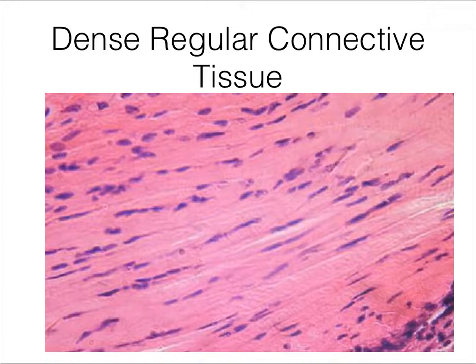Another thing that you will see is dispersed nuclei that are relatively flat. All right. So here you can see this is a nucleus here, this is a nucleus there, this is a nucleus, this is a nucleus, this is a nucleus. But if you draw a circle around the cells, and these cells aren't actually much bigger than the nuclei, then you'll see that the cells themselves are not densely packed.